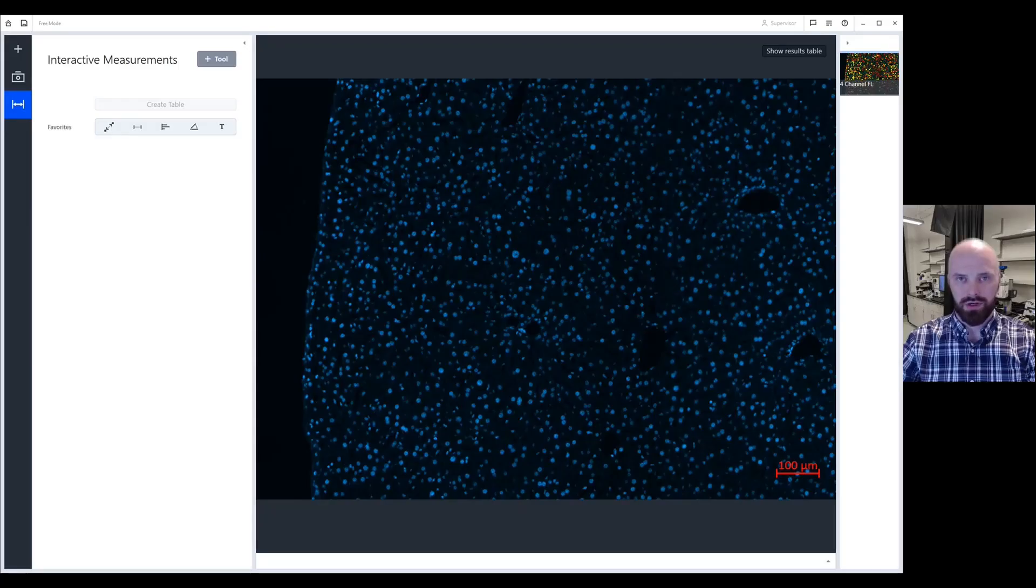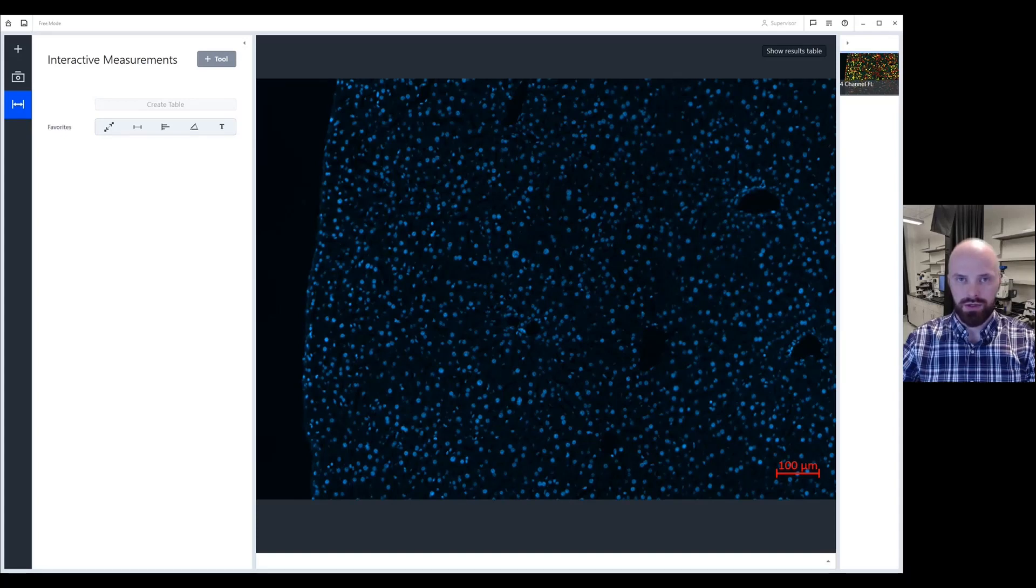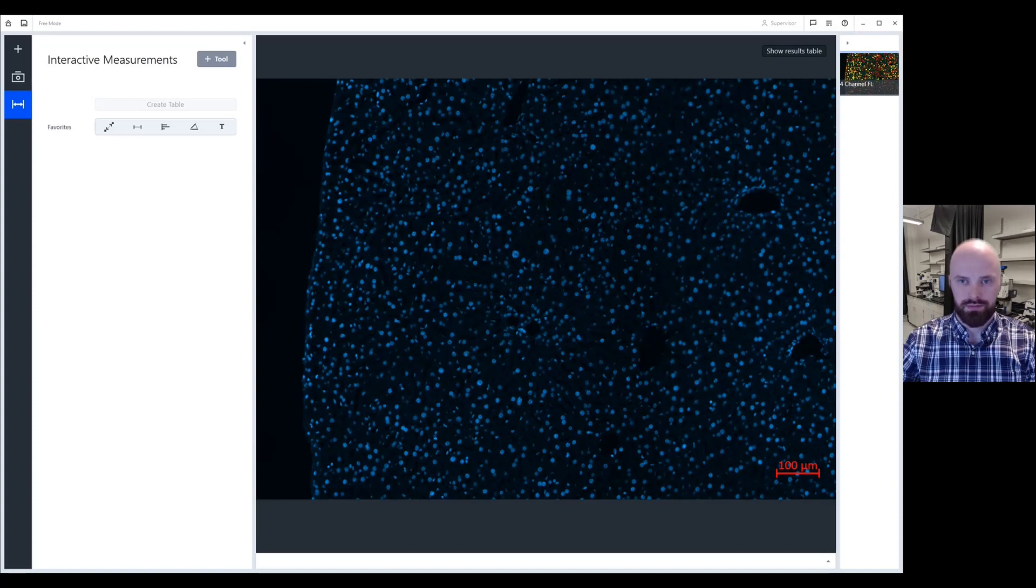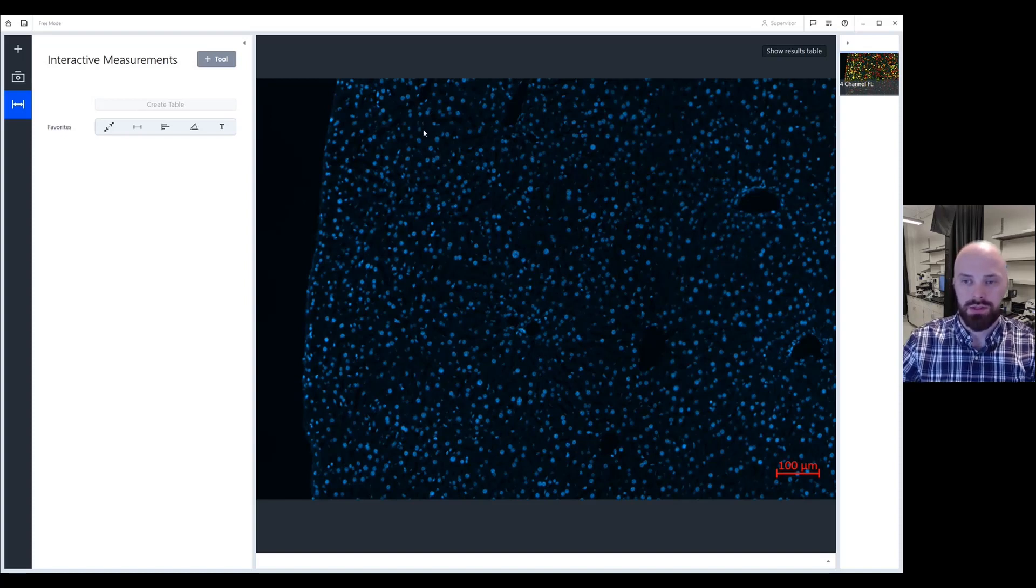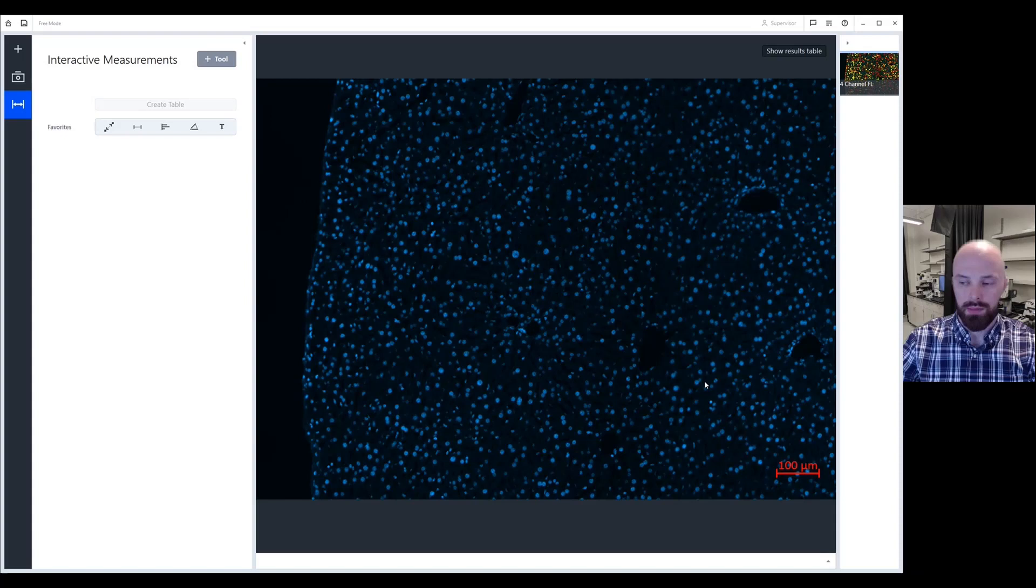Today, I would like to go over how to change the position and format the scale bar in Zeiss Zencore software. Whenever you snap an image in Zencore, a scale bar will automatically be applied to the bottom right corner of your image.